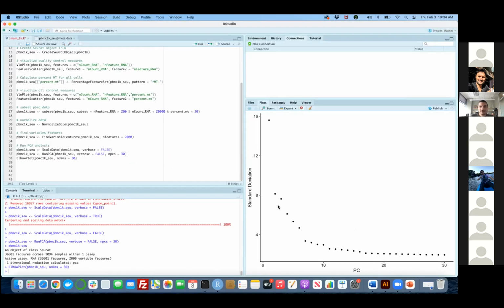So what I'm understanding over here, and it might be different for you guys, you may just say, okay, yeah. Sorry, I stopped you, but I got confused here. If we are using all the 2,000 genes for the PCA, then what's the role of the variances that we found?